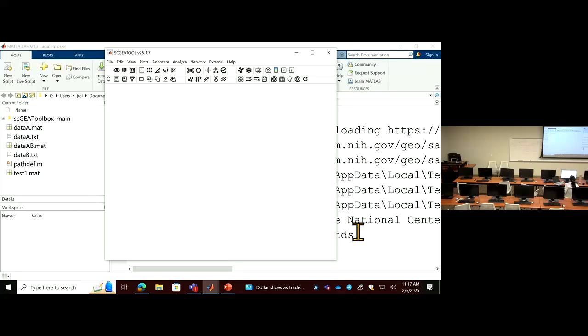This is a huge data set, so it's a good example to show the QC, because we want to trim it by quality of cells and quality of genes to make it smaller. Today we probably cannot do the second sample because of its size. So we are going to focus on the first sample to trim it and do the QC correctly, okay?